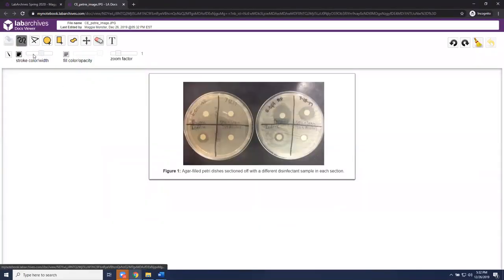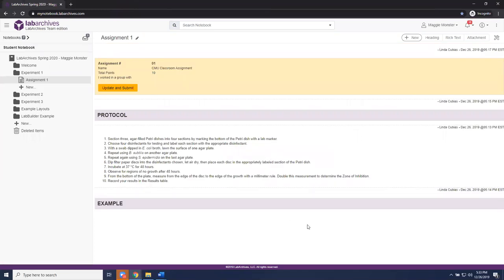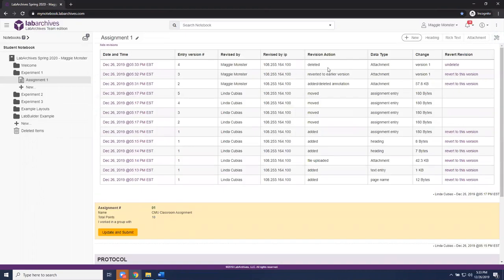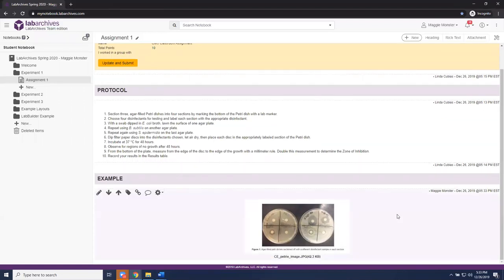If you accidentally delete something, such as an image needed to complete an assignment, don't panic. You can use the page tool revisions at the top via the toolbox icon in the upper right-hand corner, go to 'View Revisions,' find the image you accidentally deleted, and bring it back onto the page. This shows the security features built in, because naturally mistakes happen — maybe you needed to edit rather than delete, but this shows how you can make corrections along the way.